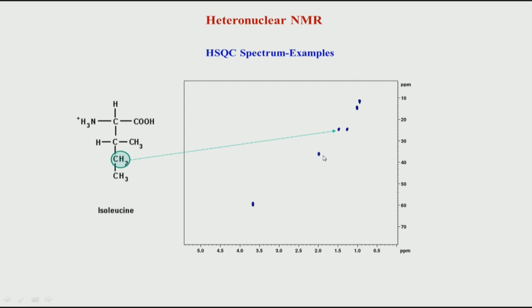Now, coming to this peak here. So, there are two peaks left, one is this CH here and another is this CH. Now, if you look at this CH, similar to what we saw in the previous example in glutamine, this comes downfield shifted because it is attached to two electronegative groups. So, therefore, this one down here is most likely going to be from this.